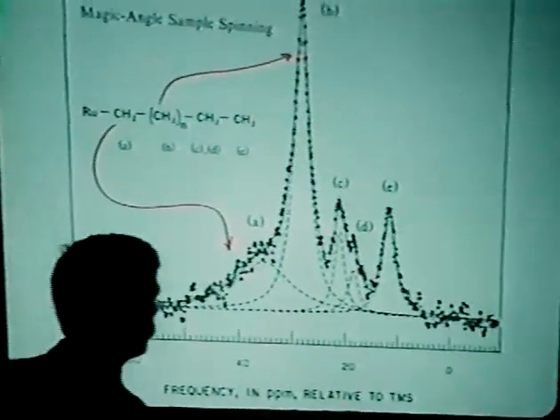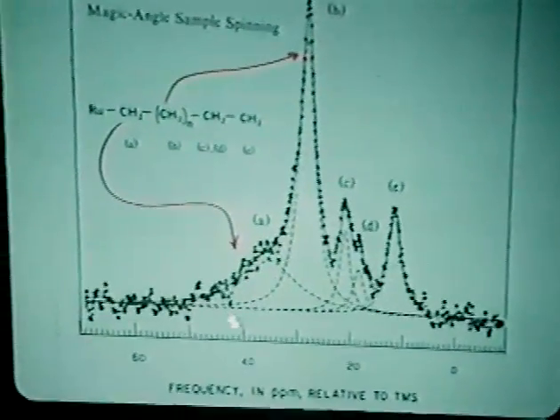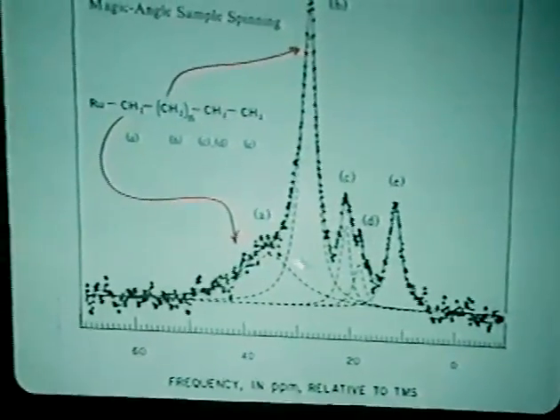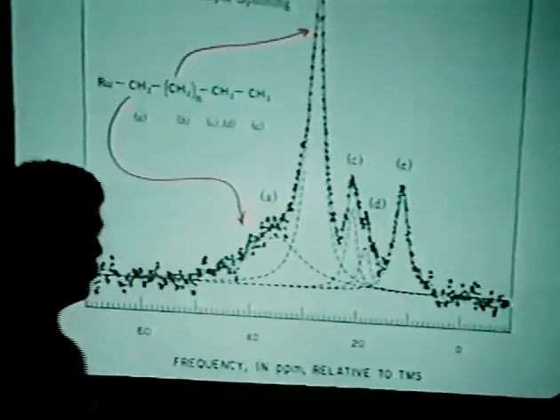As we pointed out before, we don't exactly know where carbons should be when they're bonded to the rutheniums. It can be anywhere from 40 ppm down to minus 10 ppm. This line having the broad width suggests some heterogeneity of the surface, which corresponds well with that assignment.